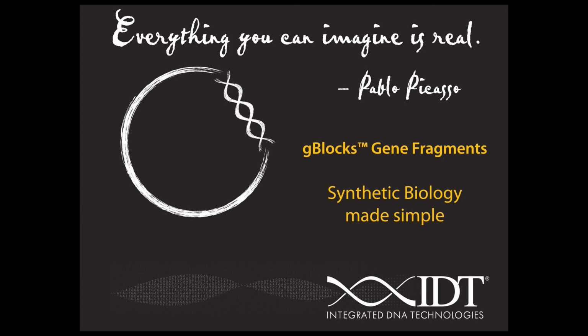And the biggest change that I made to the rules came in late November of last year, where we were able to relax several of the rules, including rules about GC content, and particularly rules about hairpins and other types of repeat. We do still have problems with high GC content and low GC content, and sequences that are above around 70% GC content are often rejected. Unfortunately, we still do struggle a lot to manufacture those.